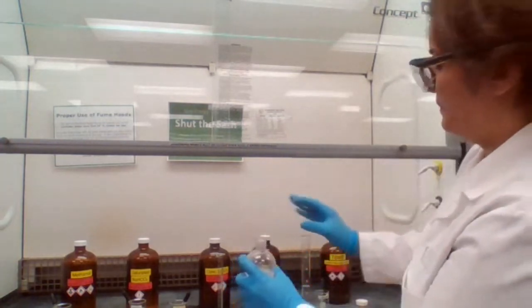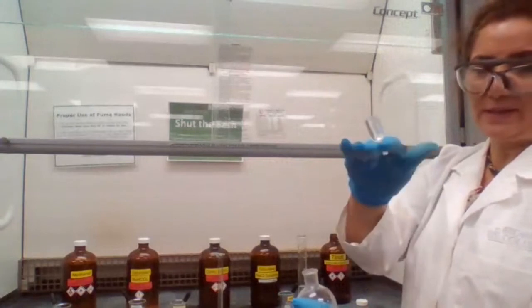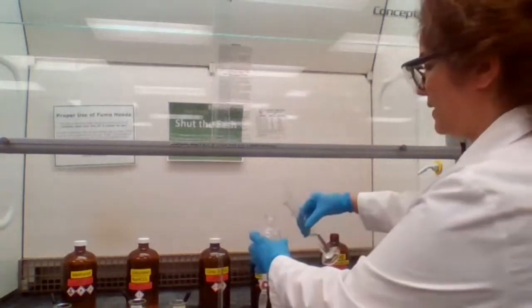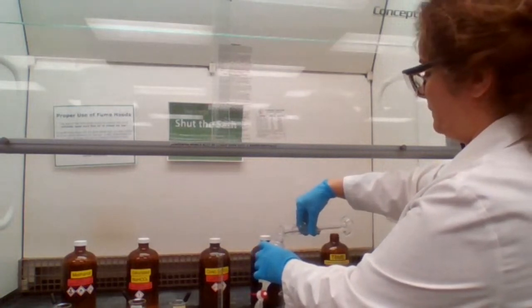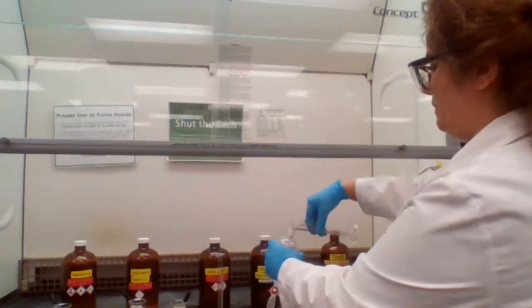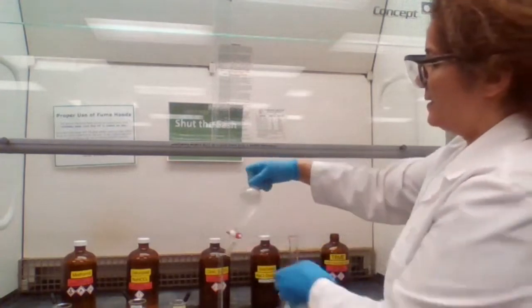I add the ether. One of the ways you can avoid contamination is holding the cap using the hand that you're holding the bottle or transferring. It's okay, it's good practice. Cap it, make sure that it's secure, and mix it.